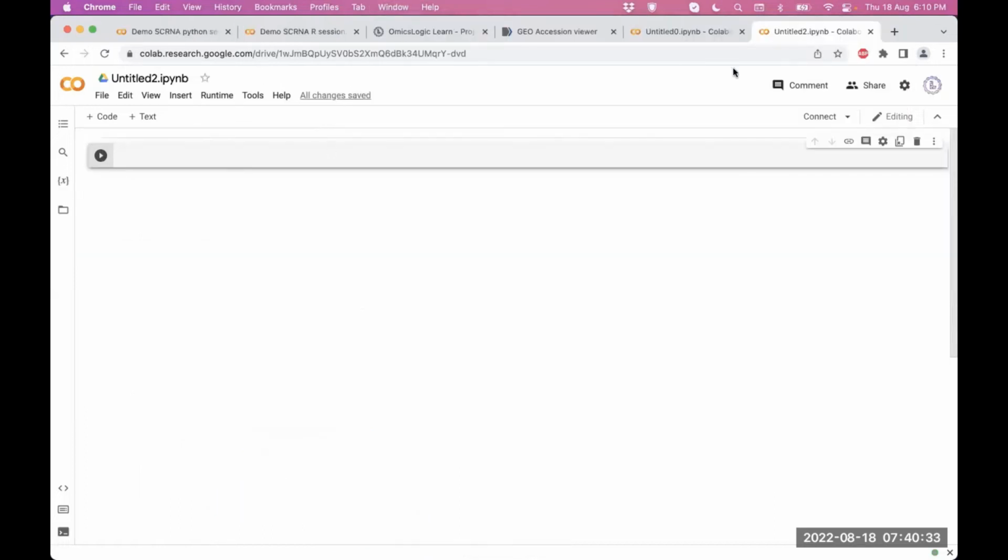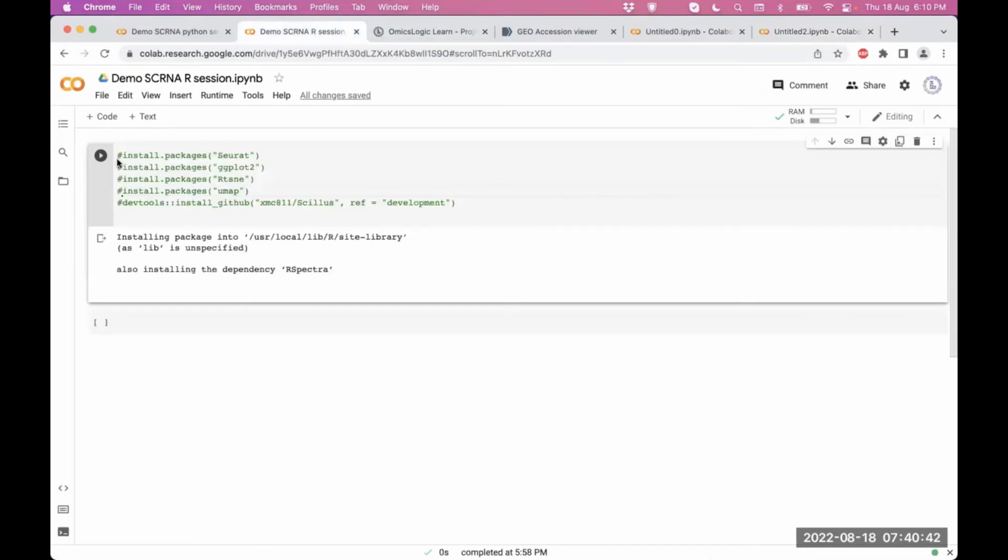So everybody has opened your R Colab here. If everybody has opened up your R Colab, I want you to run these and then forget about that Colab. We will come back to this Colab by the time that we are here, when it would have completed our installation.